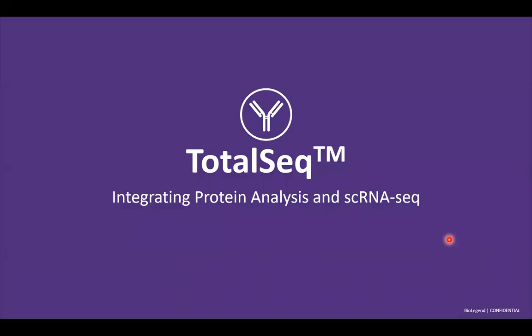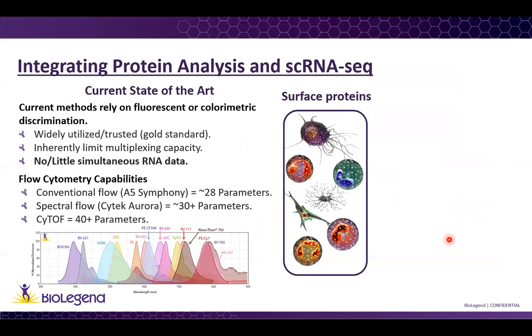So now let's talk about how to integrate protein analysis to single-cell RNA-seq. First, let's think about this question. Why could it be important to add protein analysis to single-cell RNA-seq? Analysis of cell surface molecules allows you to phenotype cells and identify different populations.